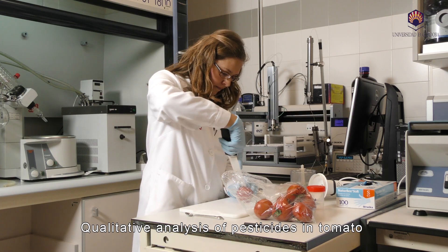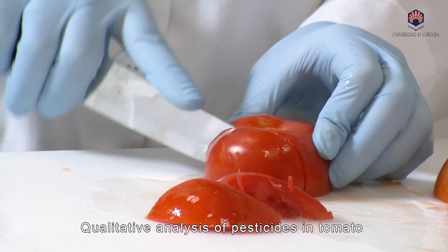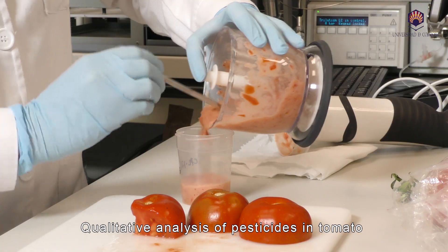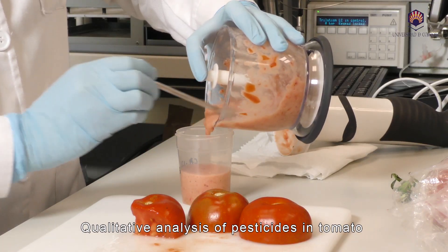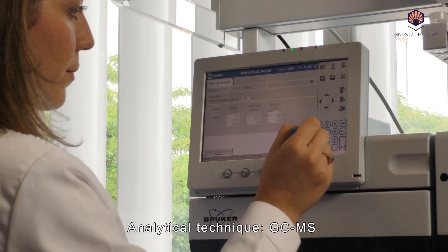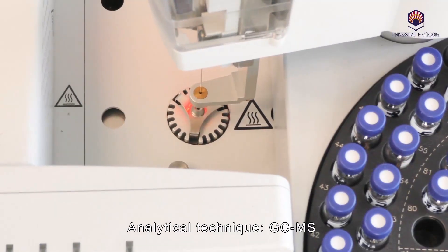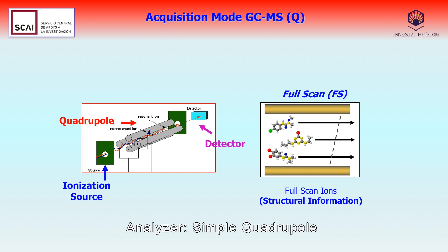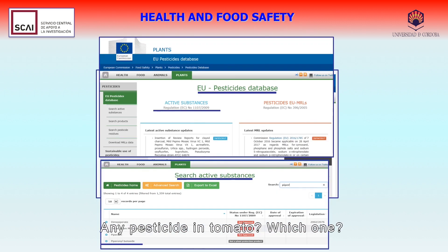We carry out a qualitative analysis of pesticides in a food of plant origins such as tomato, using as analytical technique gas chromatography mass spectrometry with a single quadrupole analyzer. The objective of this analysis was to detect the possible presence of pesticides in food.